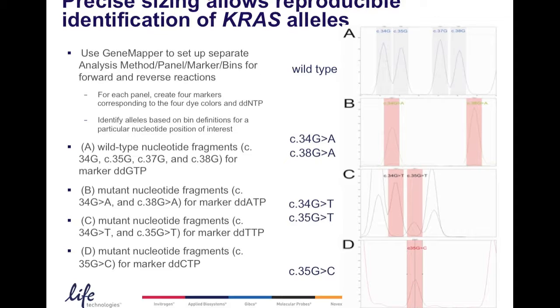In GeneMapper, we can set up bins that detect all these nucleotides at these various positions. Shown here is the wild type: the guanine at position 34, the guanine at position 35, 37, and 38. Here, we have a bin for a mutant position, the 34 G to A transition. And here we have a bin for the c38 G to A transition. Likewise, we can set up bins for all of these possible mutations.